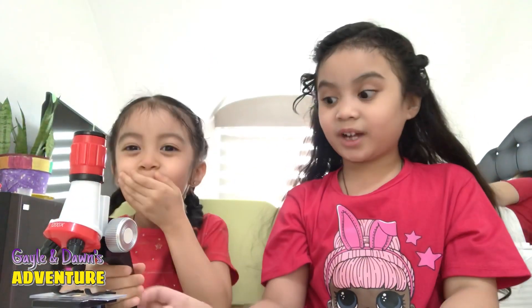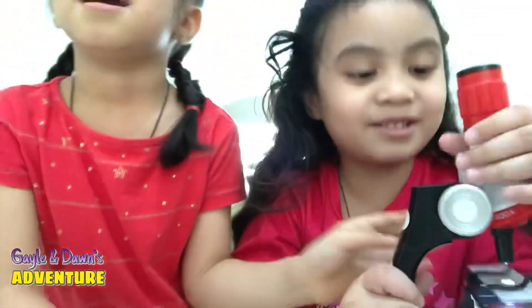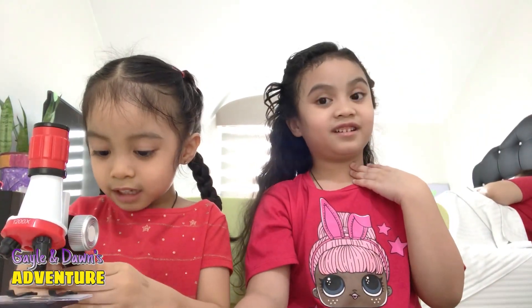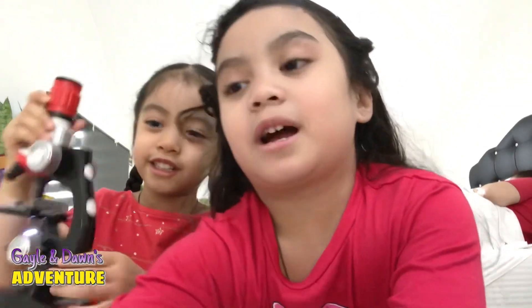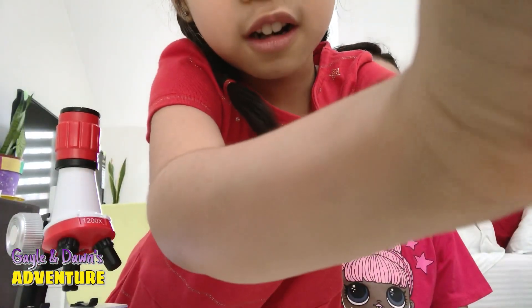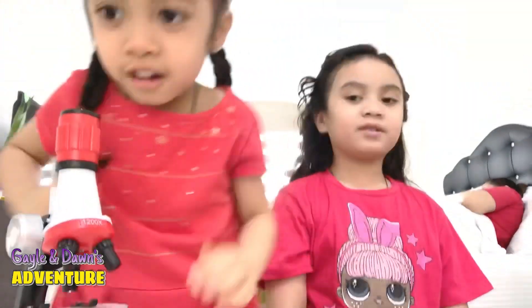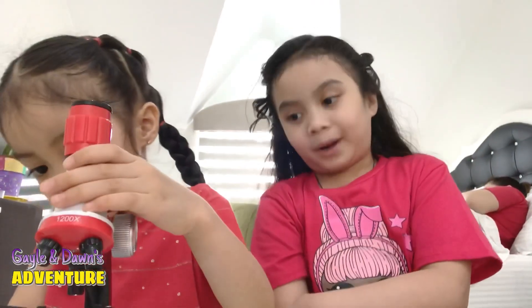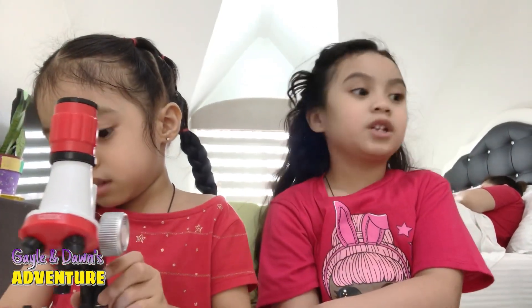Whoa! If you guys want to see here — oh my god, is it so dark? Oh my god, I can literally see it! I put some scissors in here. I'm going to take the camera — it's like actually a binoculars. Yes, but you're not here. Oh my god! What do you think we should put on some of the lenses?